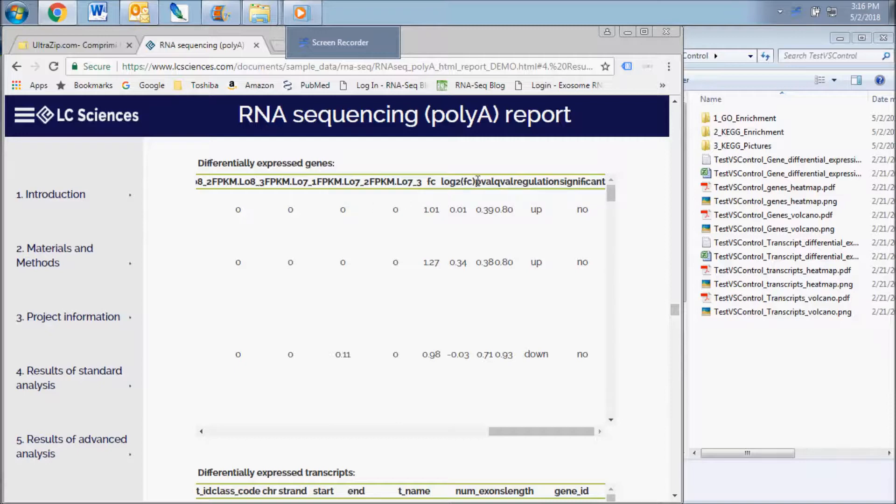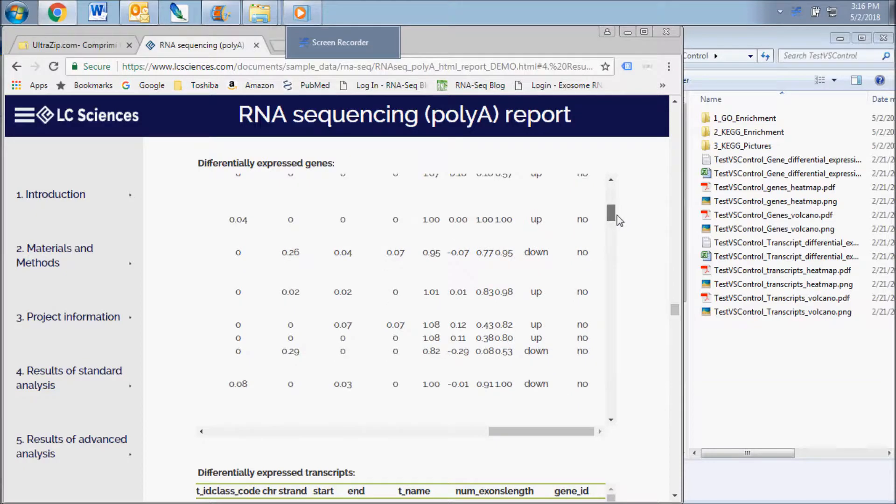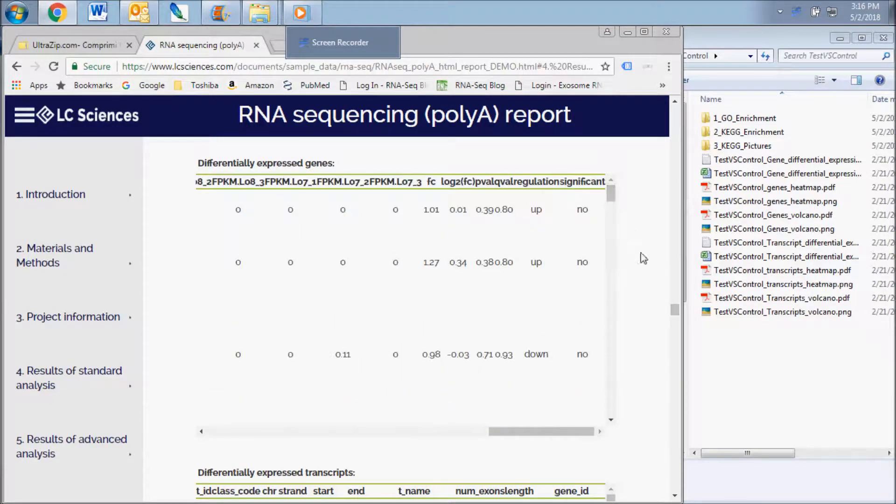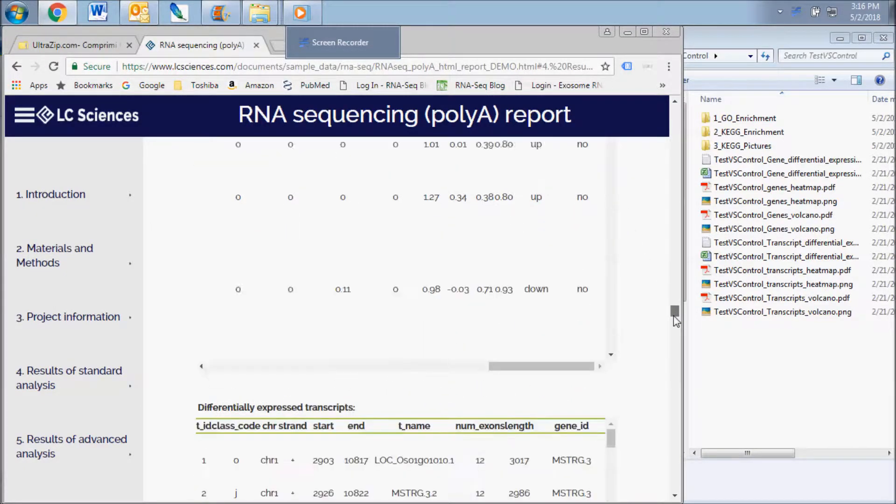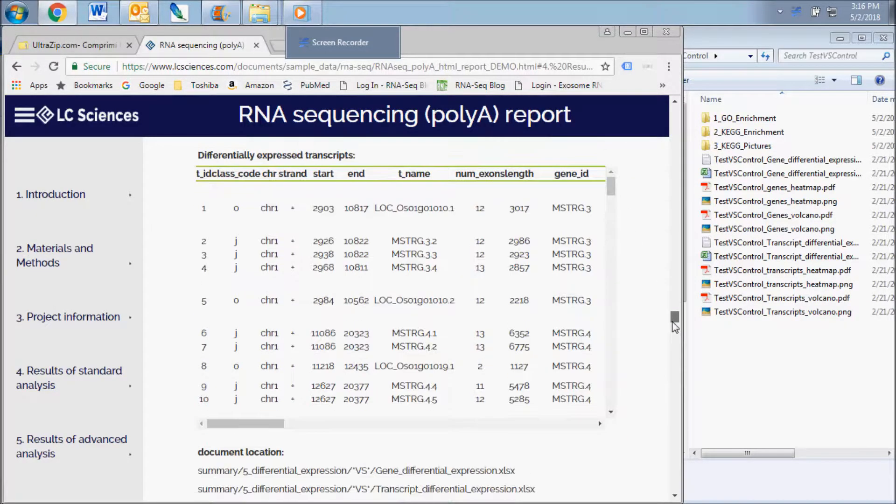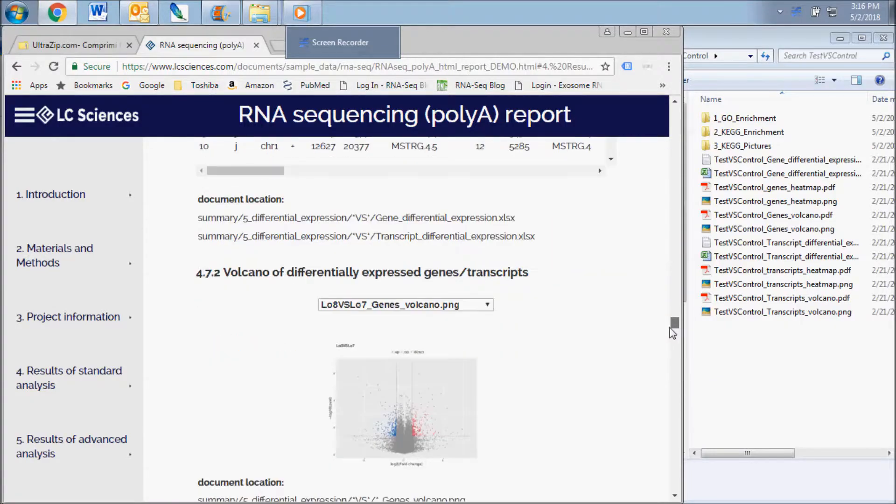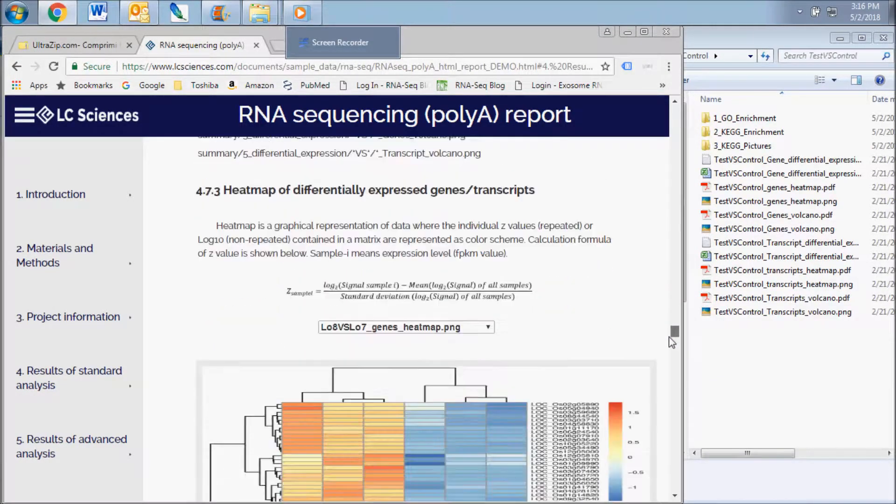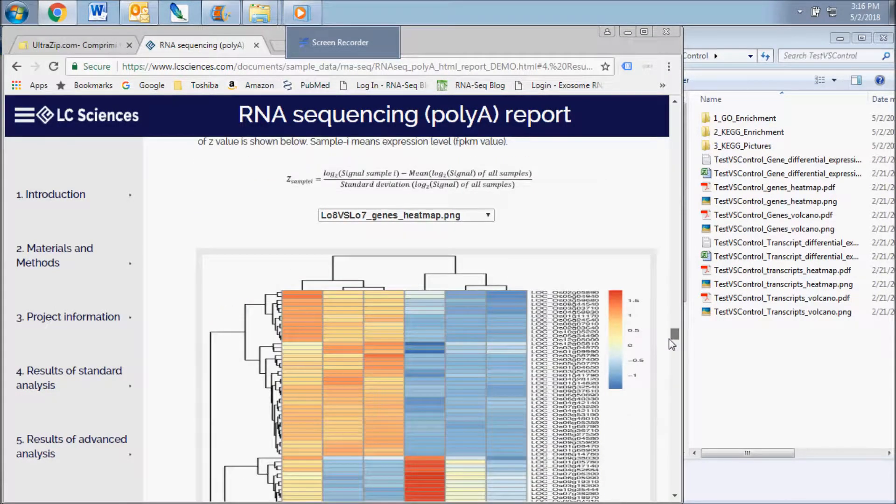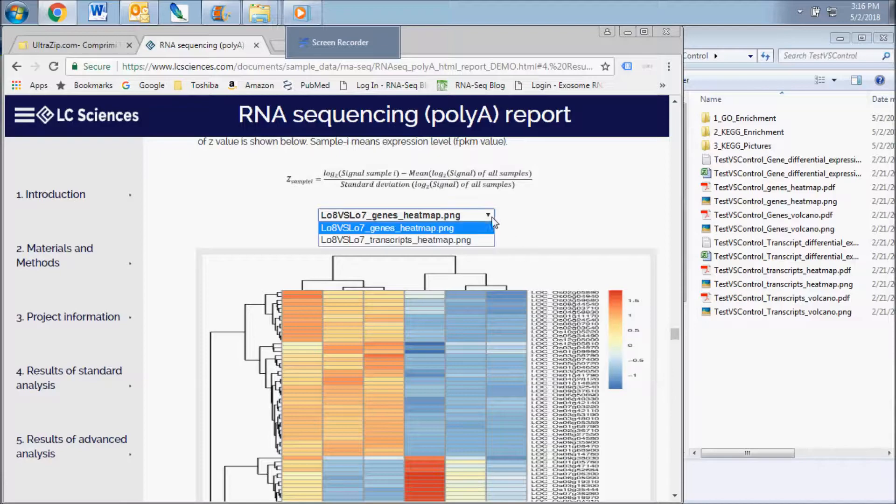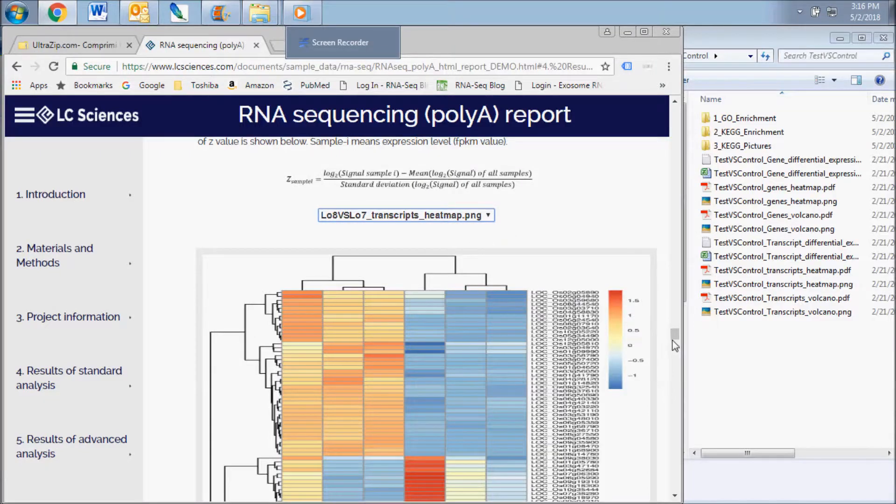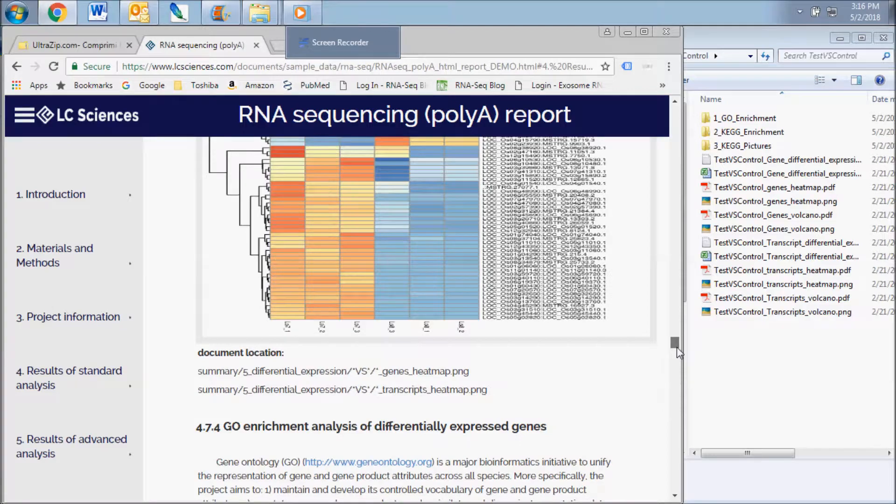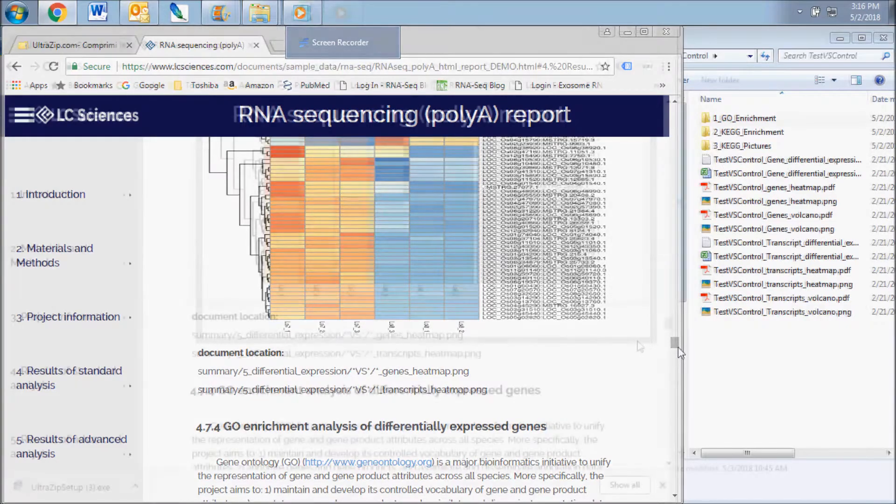This includes log-base two fold change and the direction and significance of the regulation of each individual gene or transcript between test groups. Also included are a volcano plot and a heat map for visualization of the differentially expressed genes and transcripts. You can use the drop-down box to select the chart for each comparison.